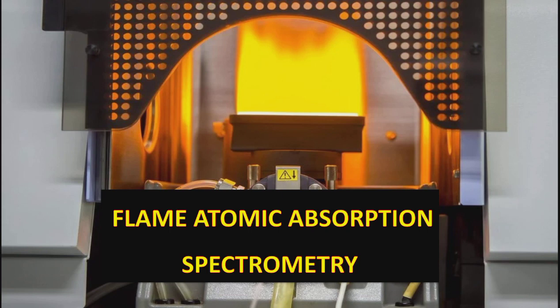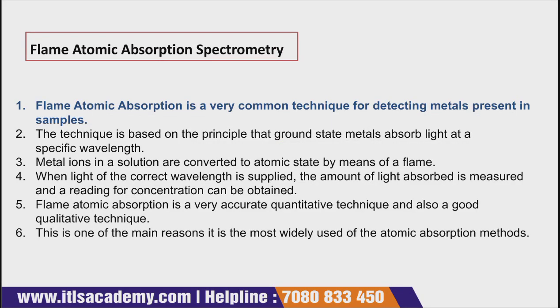So today in this lecture we are going to study our next topic, that is flame atomic absorption spectrometry. In the previous lecture we discussed different types of spectrometry. For example, we discussed atomic absorption spectrometry and X-ray fluorescence spectrometry. So today we are going to discuss flame atomic absorption spectrometry.